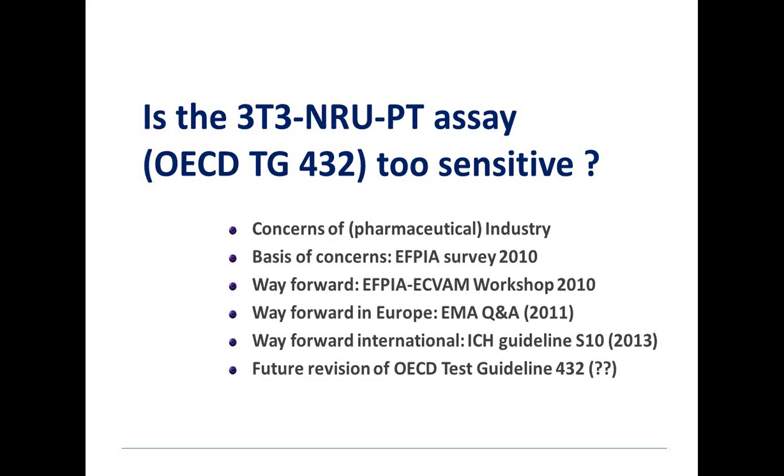In the pharmaceutical industry, each new drug candidate substance that absorbs significantly has to be tested for phototoxicity, and the concerns were that too many materials turned out to be positive in a 3T3.